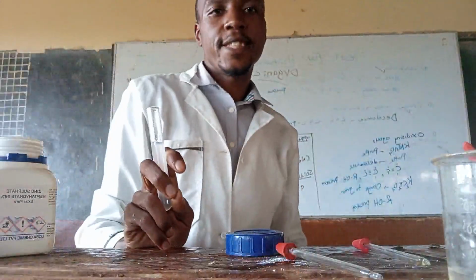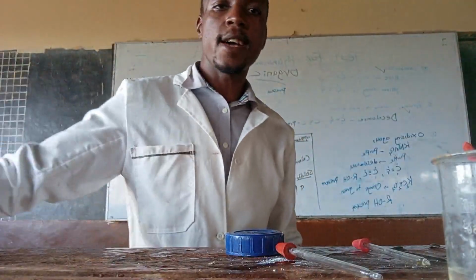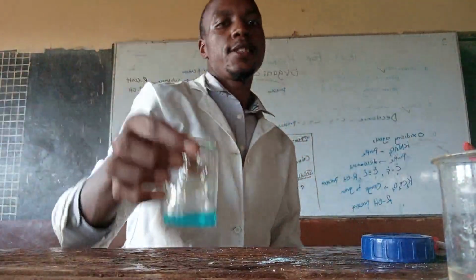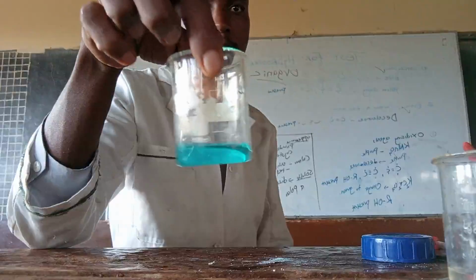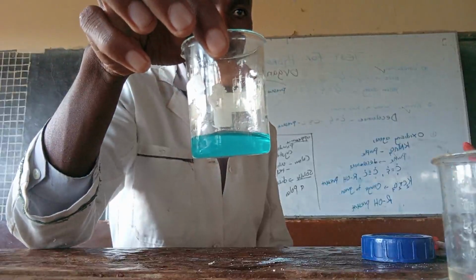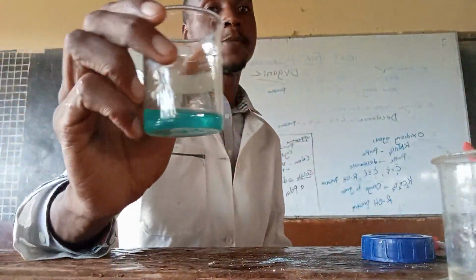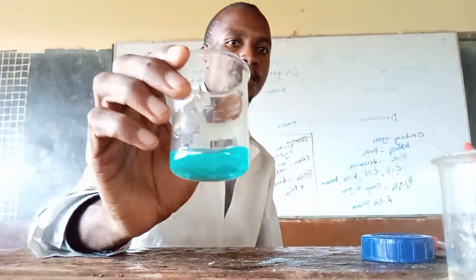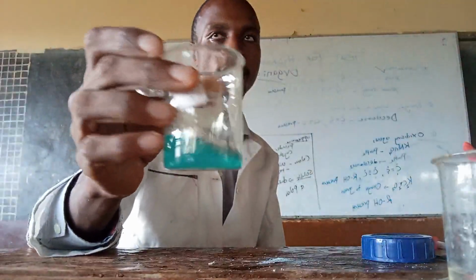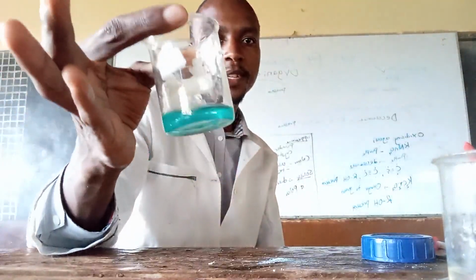And now we get into the colored ions. Colored ions. When you dissolve copper in water, you get a blue solution like this. This one is a blue solution. No, precipitates are not yet formed. It's a blue solution. So already you know the question you are dealing with is a copper question. Simple like that. Copper ions present.